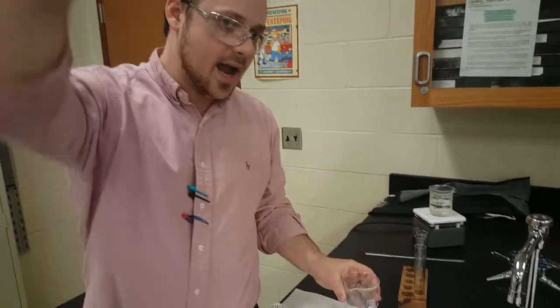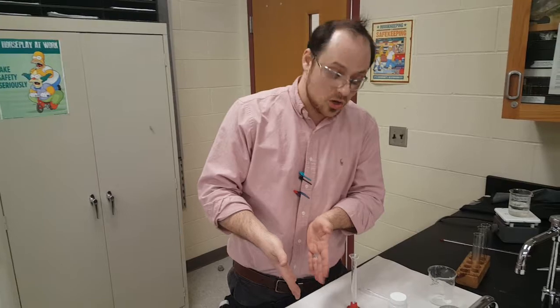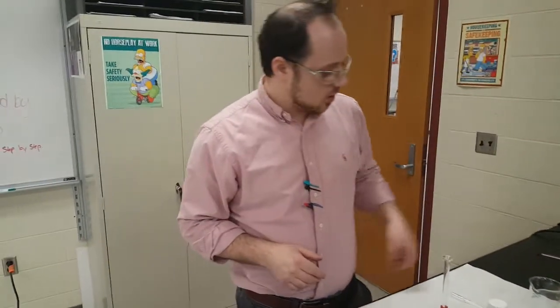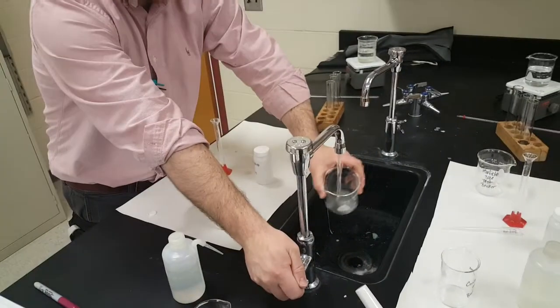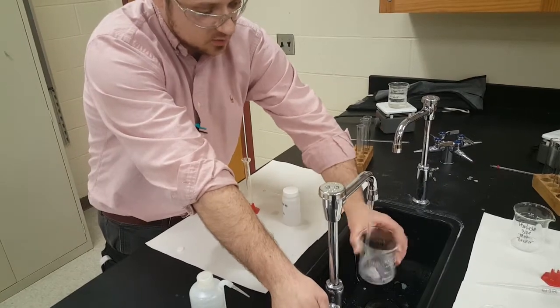Nice powder. And to this powder, we're going to add how many mils of acid? 10 mils of acid, you said. Not 20, because we got to have the acid consistent in this second procedure. Yeah, the volume of acid needs to stay the same, and the particle size changes. There we go. So, clean it up, down the drain, rinse, out it goes. You're ready to move on to the third and final procedure in this particular lab.